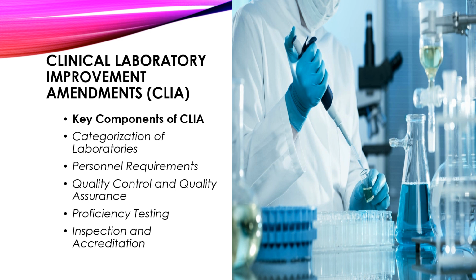Quality control and quality assurance. CLIA requires laboratories to implement comprehensive quality control measures to monitor the accuracy and reliability of test results. This includes regular calibration and maintenance of laboratory instruments, validation of testing procedures, proficiency testing, and documentation of quality assurance activities.